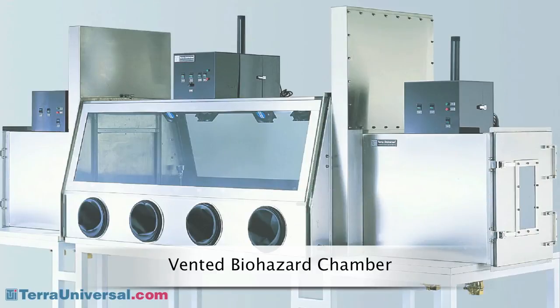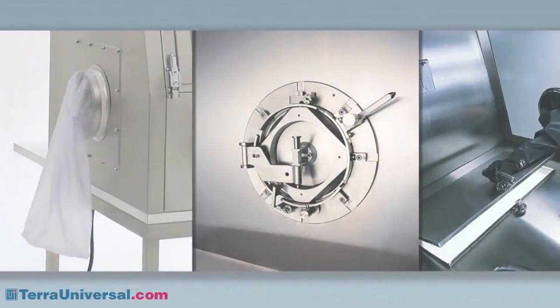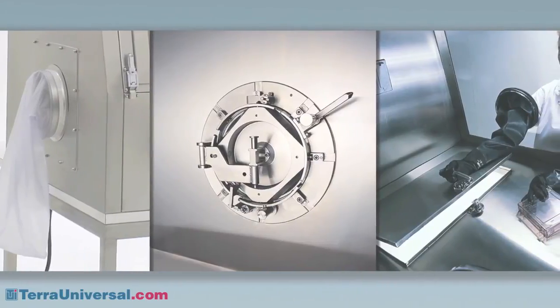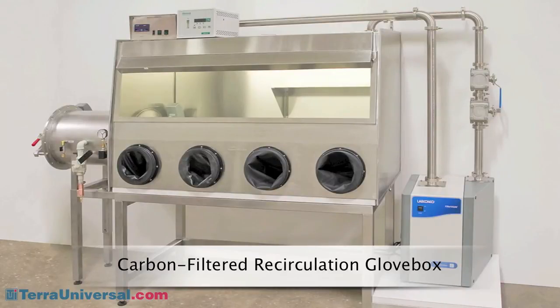Tera also provides a number of containment solutions, ranging from extremely low-leak rate chambers to ventilation modules that maintain a negative pressure to protect the operator and lab from potential biohazards. Choose among a number of bag-in, bag-out ports and low-leak hatches, and other special access ports to facilitate parts transfer. Additional biohazard solutions include activated carbon filters, photocatalytic oxidation panels, and UV-C irradiation modules.